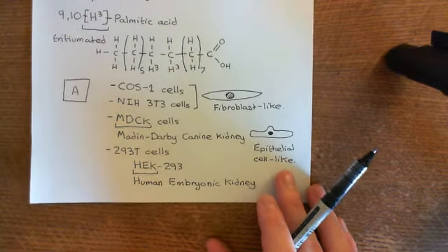Right. So now what we're going to do is starve the cell for an hour, basically. This is so that the cell will run out of normal palmitic acid. And so when we add in our radioactively labeled palmitic acid, suddenly the cell will use that palmitic acid to add on to the protein A that it's been producing, basically.